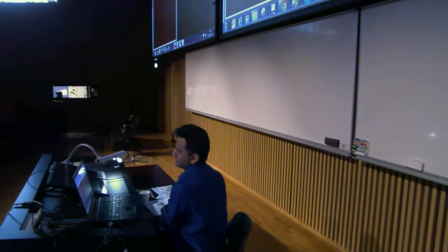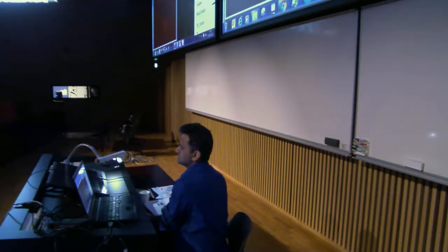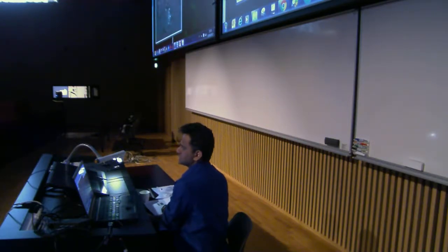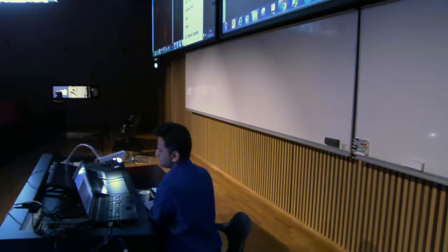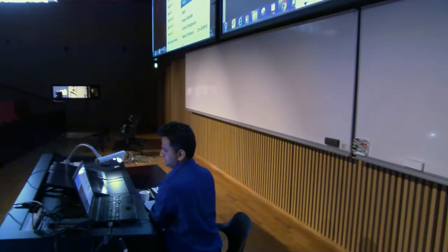Subtract. Okay, and now this is what you see. You can change the lookup table because this may not look okay. So just to put it gray. So now you can see actually what's happening simultaneously. So likewise, you can do all the arithmetic calculations. This is all about this one.